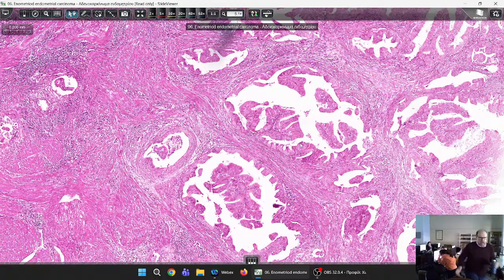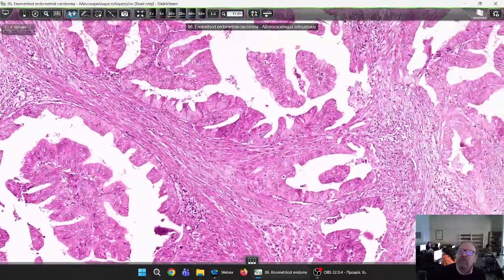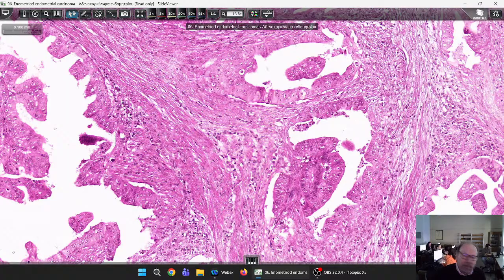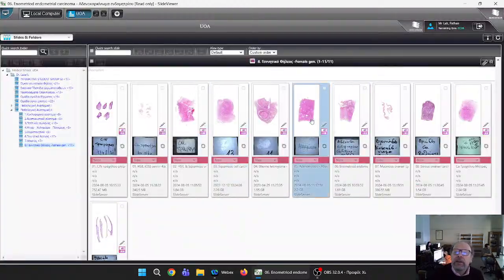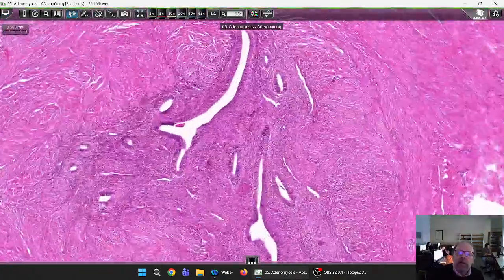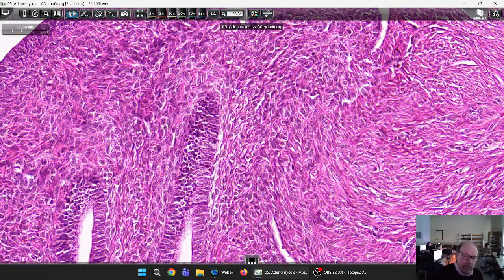Do you remember? Let me show you. So have in mind what this tissue looks like. How would you describe this tissue? Look here. What is this? This is what cancer causes. This type of stromal reaction is caused by cancer. And have a look in the previous slide how normal stroma looks like. Look, this is normal stroma.